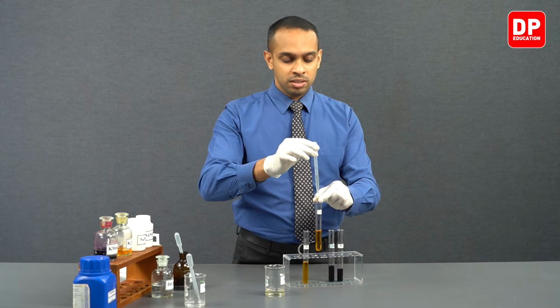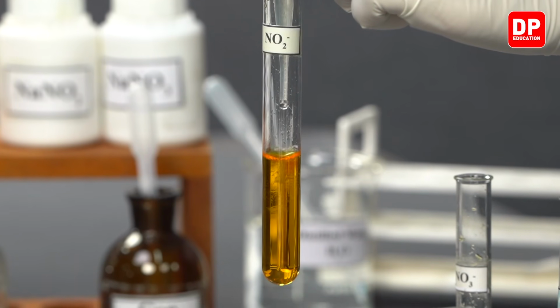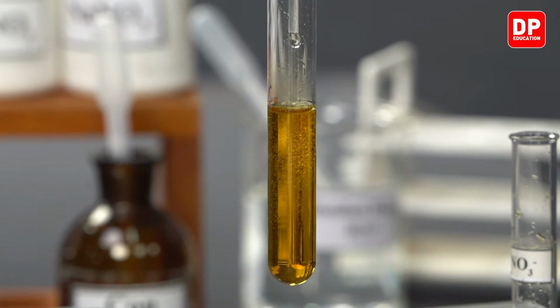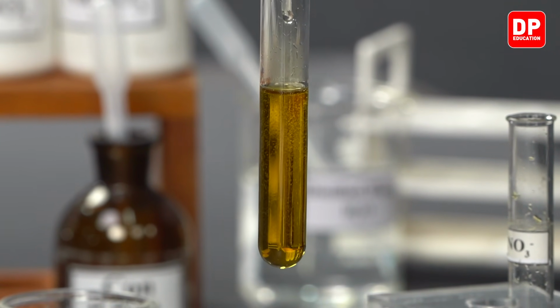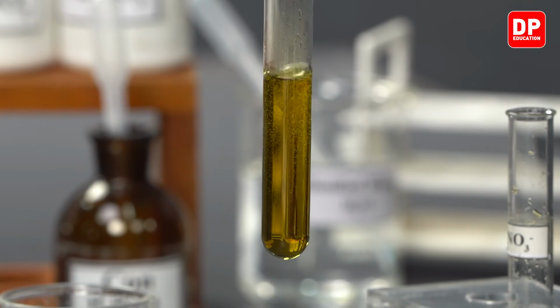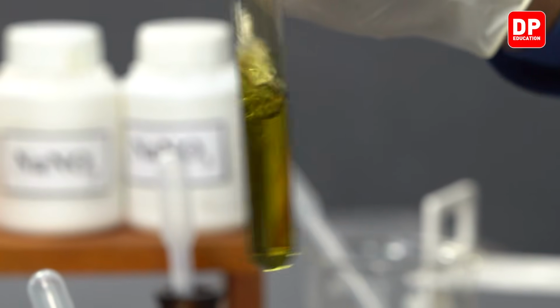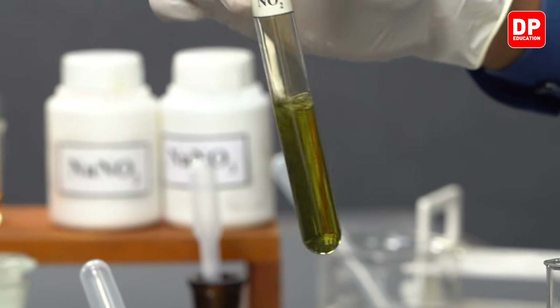Now observe what happens when we add a few drops of nitrite ions to acidified potassium dichromate solution. You can see it is gradually changing its color. And you can now observe it is green in color.